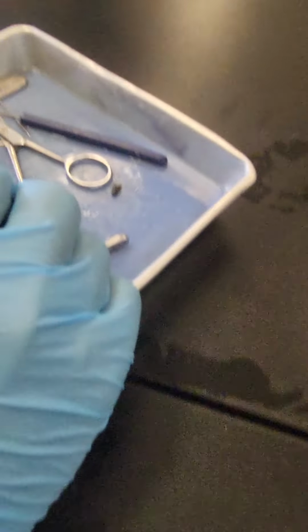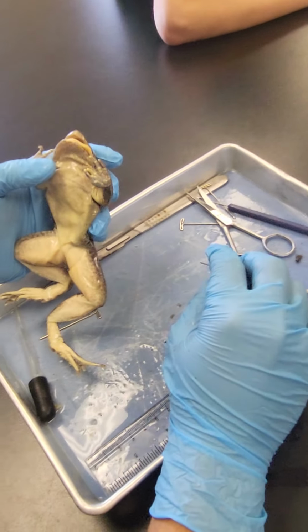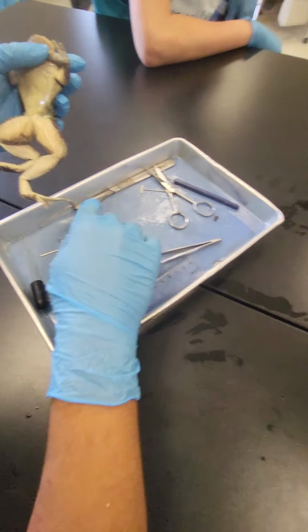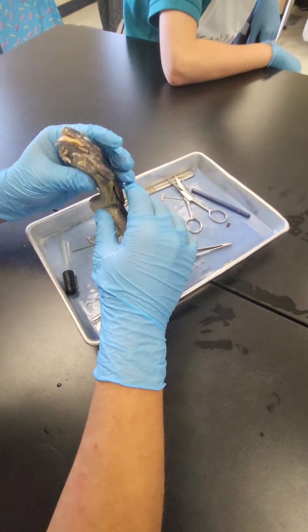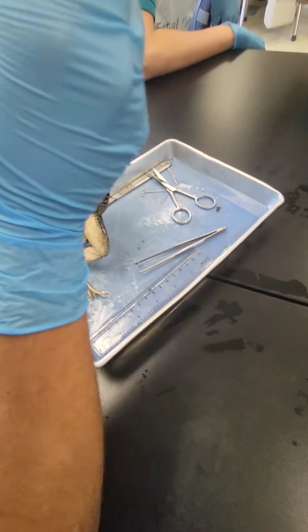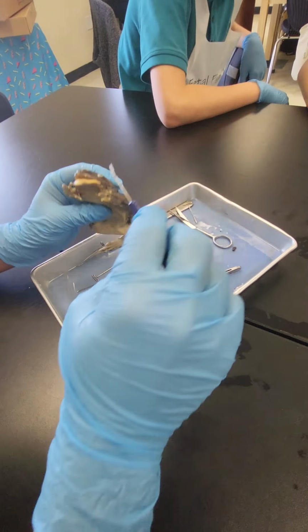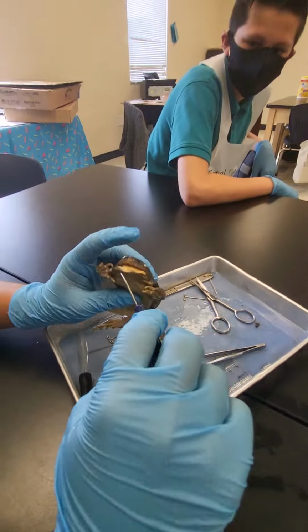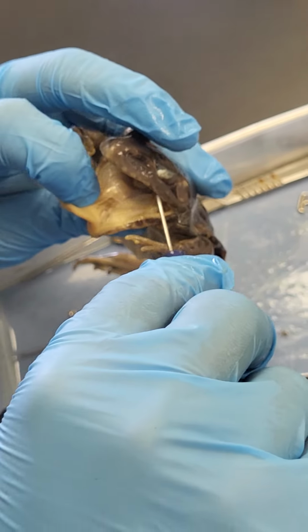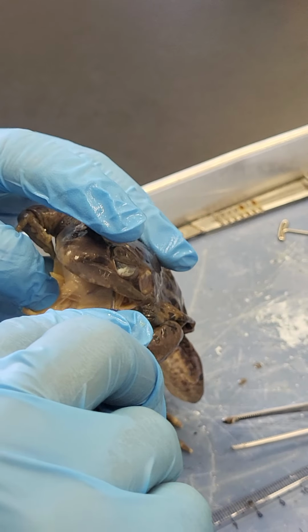Miss, what's the probe? It's one of those things. Is it the blue thing? No. The stick thing. This one? Not like the dental tool? Okay. Find a straight one. Oh boy, here we go. Wait, what do we have to do? Stick it down his esophagus, basically. Oh, God.